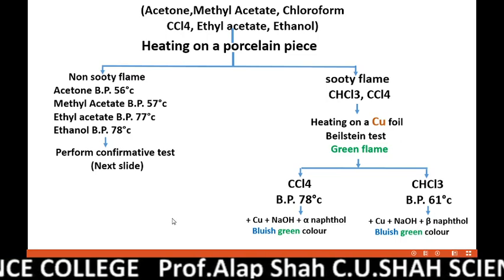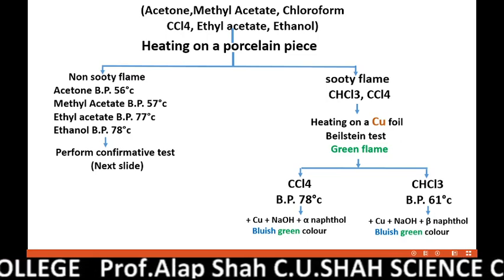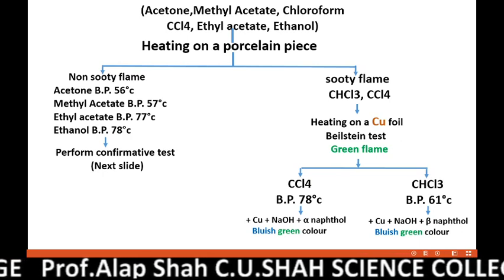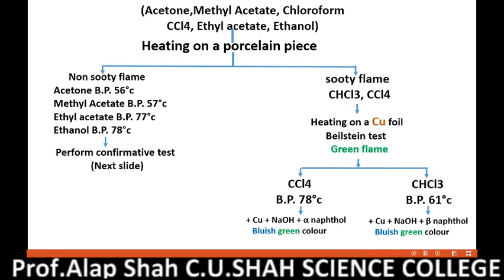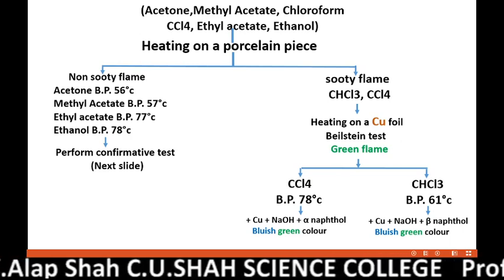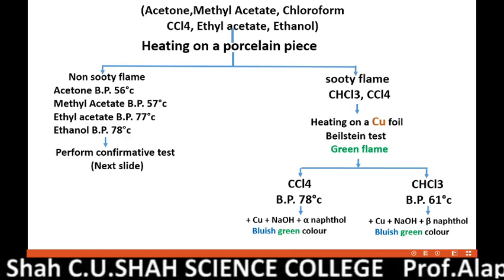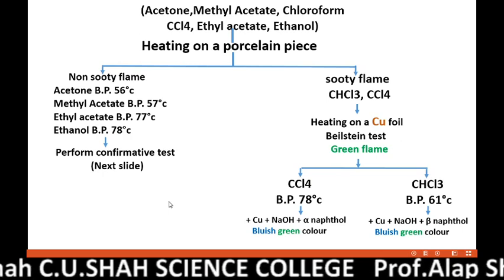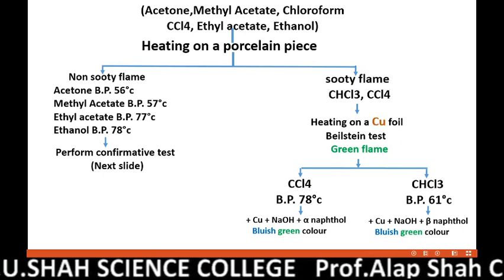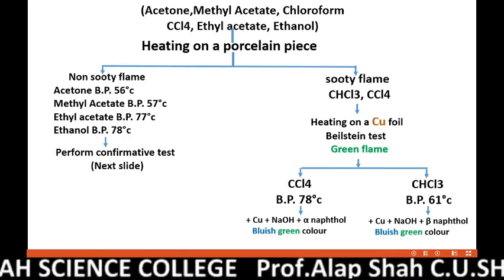But you can use this method only if you accurately perform the porcelain heating, because I have observed that many students in final year also don't perform porcelain heating precisely. So this is the way. I hope this video can be helpful to you in identifying and distinguishing among those liquids having boiling points below 100 degrees Celsius.